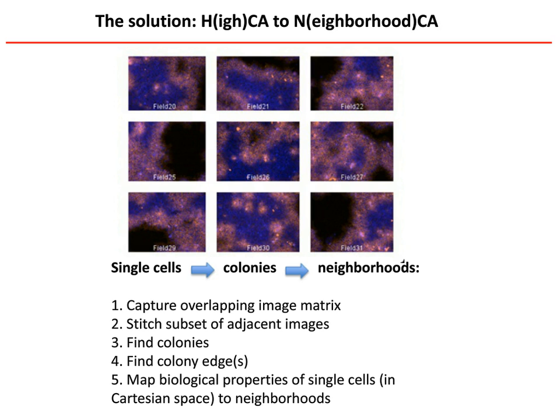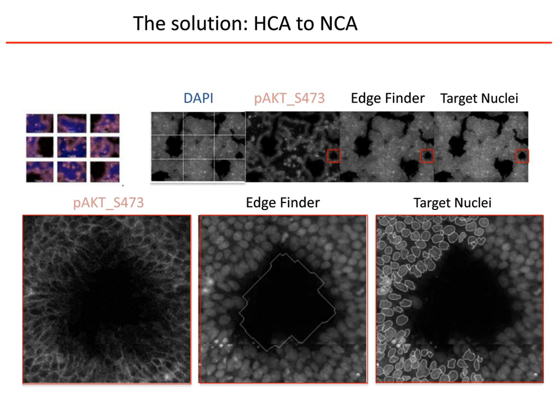That image is shown in the top left, and it's hard for your eyes, it's certainly hard for my eyes, to connect the dots and make a clear image, but the DAPI channel from that same image is shown just next to it on the right. And when the objects are a little closer together, it's completely obvious that the edges are contiguous.